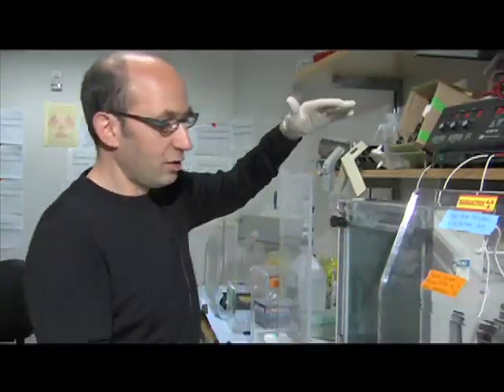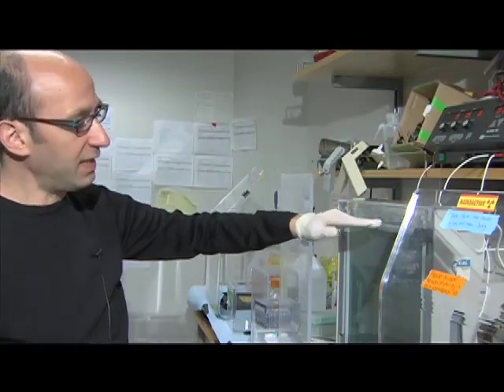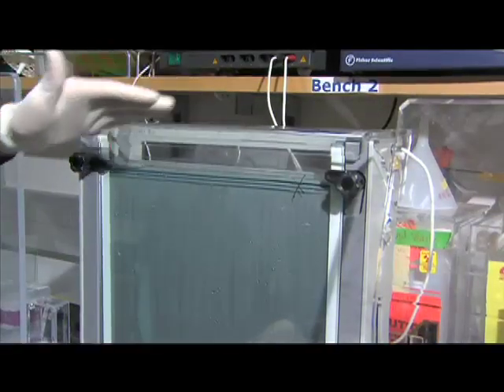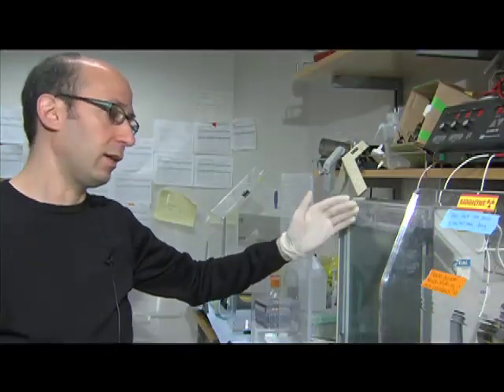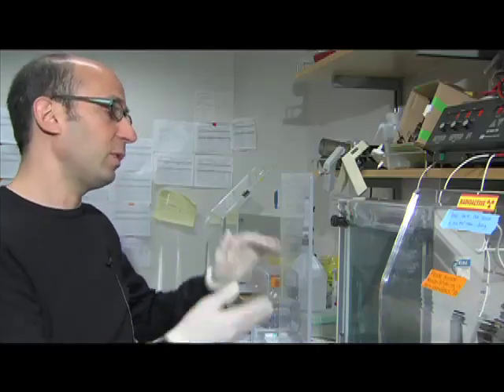turn on a strong voltage, a high electric field, and this high electric field would then separate the DNA, pull the negatively charged DNA towards the positively charged electrode at the bottom, with smaller pieces of DNA traveling faster than larger pieces of DNA. And in order to get the kind of separation we need, where we can distinguish one base pair differences in length, we need a really strong voltage.